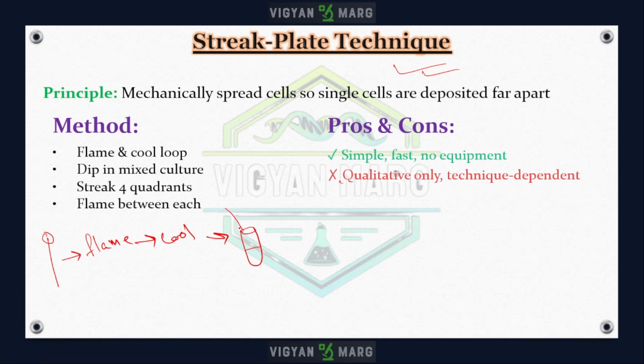Now you will pick up the mixed culture, and you will streak it on your plate.